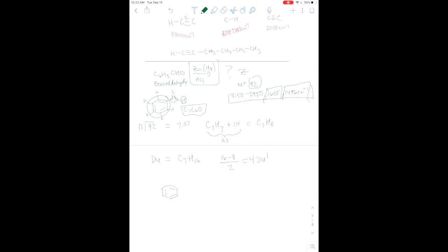So what that means is we probably just have a benzene ring, which is 6 carbons, let's throw another carbon on there, and then that's it. So we've got 1, 2, 3, 4, 5 hydrogens on the ring. We have a substituent on it, which is a methyl. So there's 5 plus 3 is 8. So that's C7H8. And this would be our proposed structure for that particular problem.